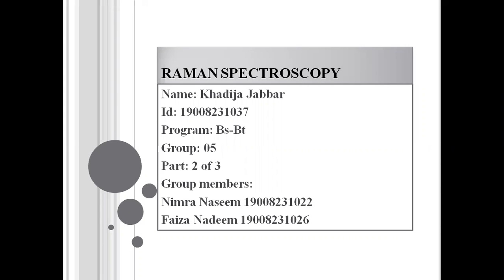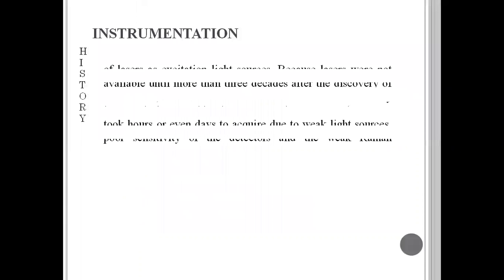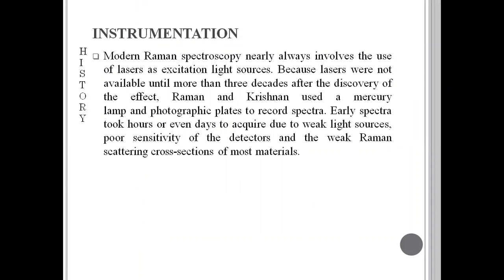And our presentation topic is Raman spectroscopy. I am here to present the instrumentation of the Raman system. First of all, we'll discuss the history of instrumentation.